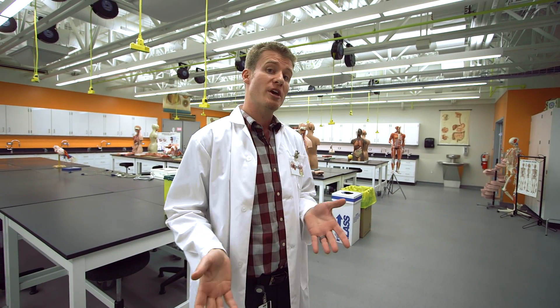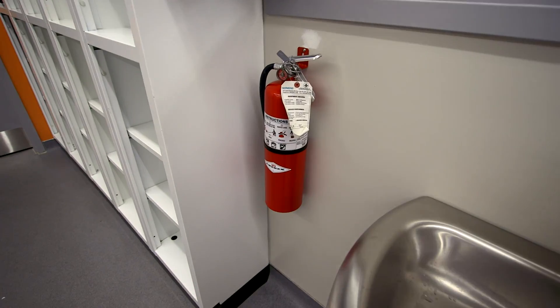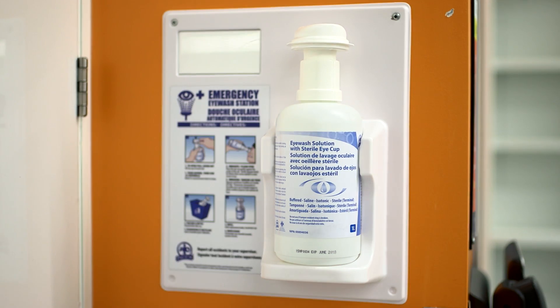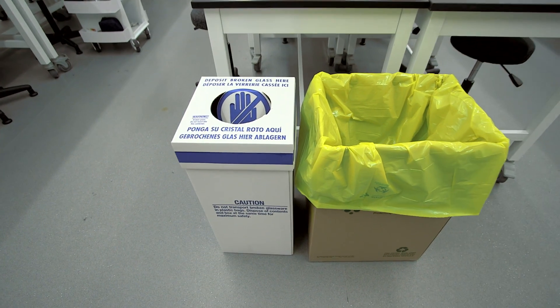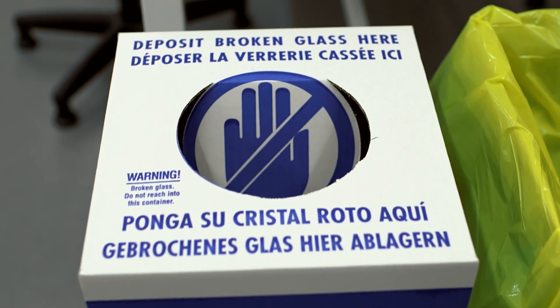When working in a lab, it's really important that you familiarize yourself with all the lab protocols and know the location of all the safety equipment. Let's look around. We have fire extinguishers by each entry door, eyewash bottles by the main lab door, and first aid kits on the wall by the cadaver lab door. There is also biohazardous waste disposal and broken glass disposal that will be out in the main lab when needed, or stored in the cadaver lab.